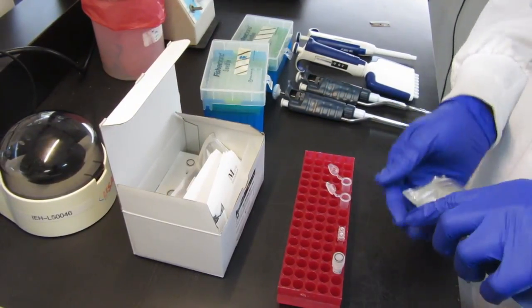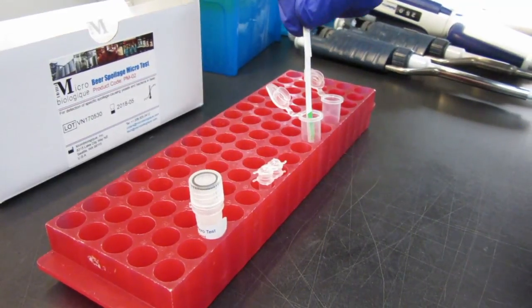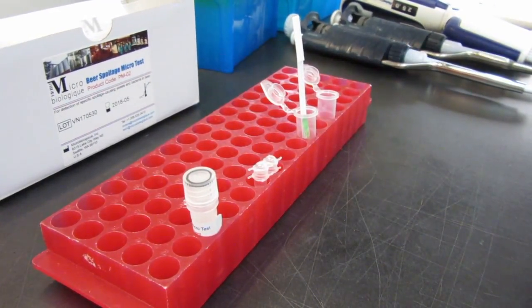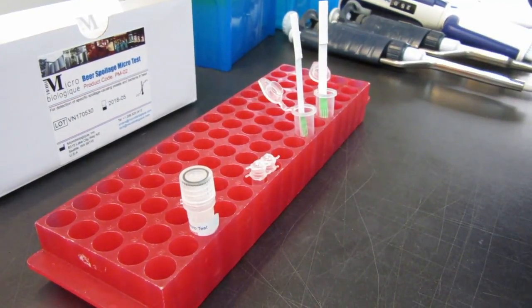Next, you will organize your lateral flow strips depending on the number of samples you are testing. Position your lateral flow test strips with the arrows pointing down into the solution. You will then allow the samples to sit for 15 to 20 minutes.